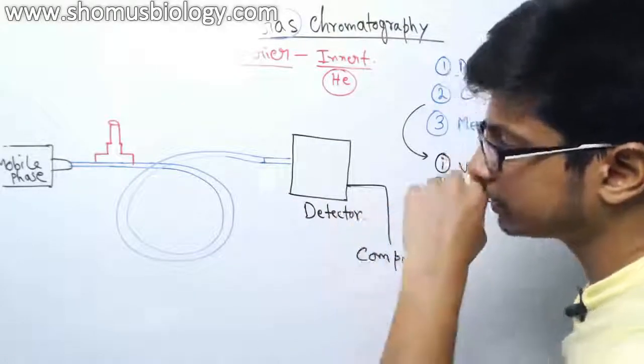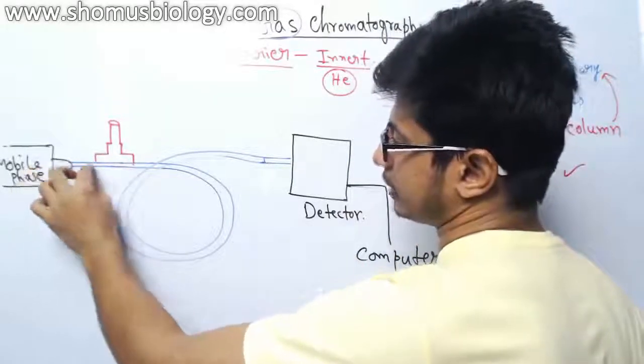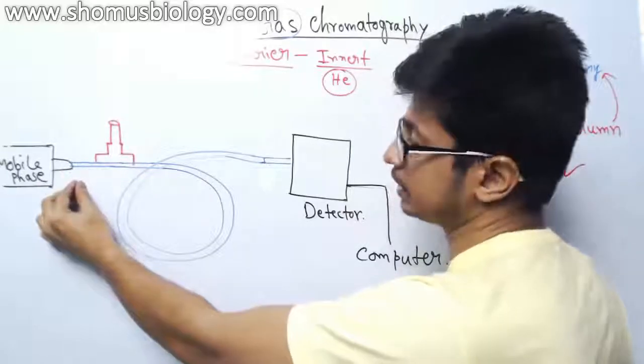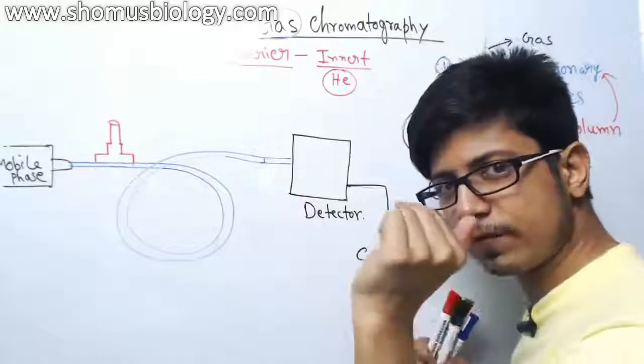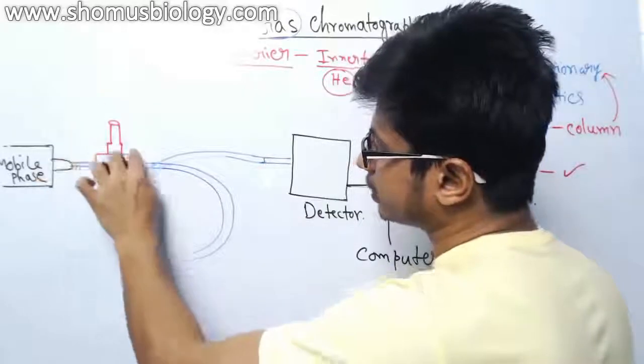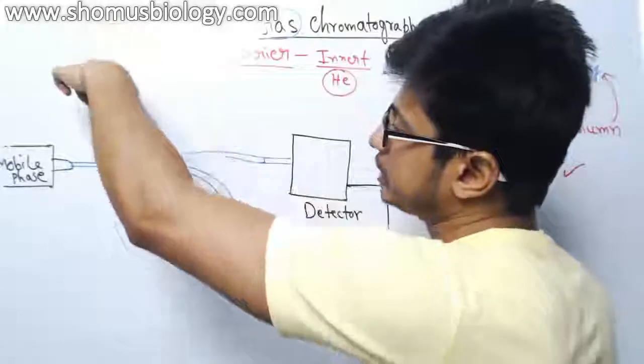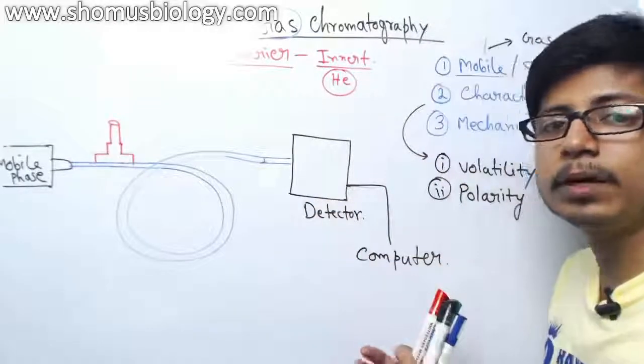So now the situation is the gas is moving one at a time here. There are different systems present which help the gas to flow in a specific thin line instead of a gathered one. This is a very interesting area because this is the sampling port, where we inject the sample that we want to separate.